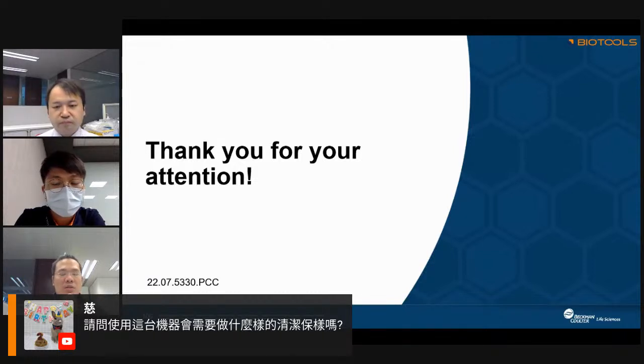We just focus on the plate for the machine. If you really want to clean it, due to maybe dust or particles from the environment, you just use some water and tissue paper to wipe it. Just very general, like cleaning a table. It's quite convenient.